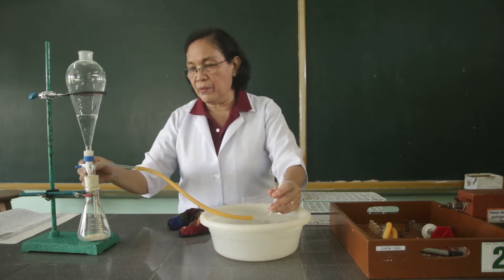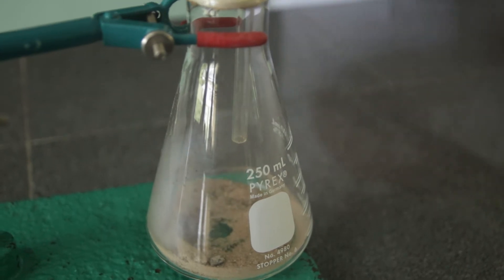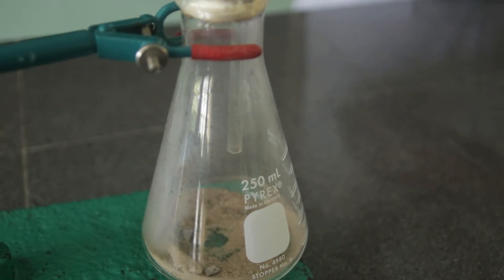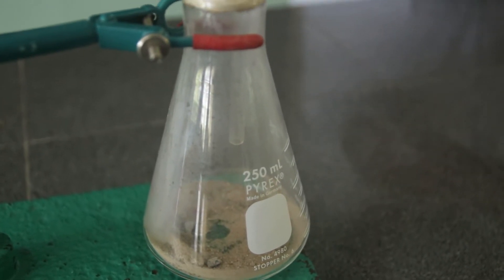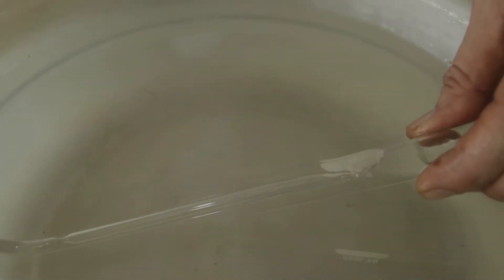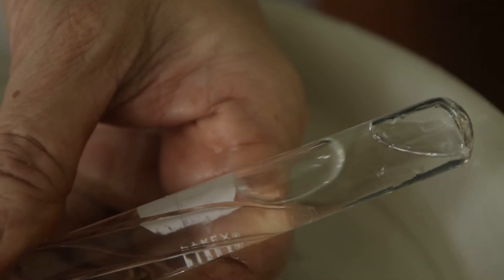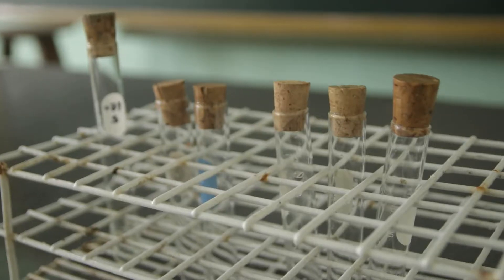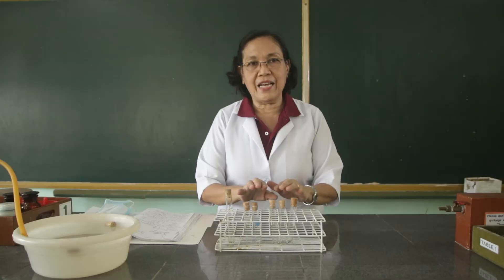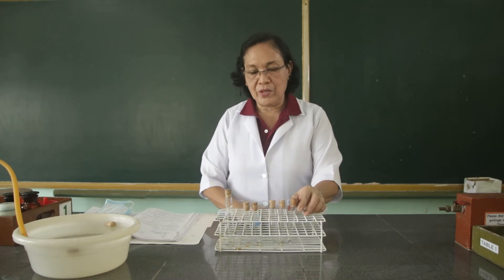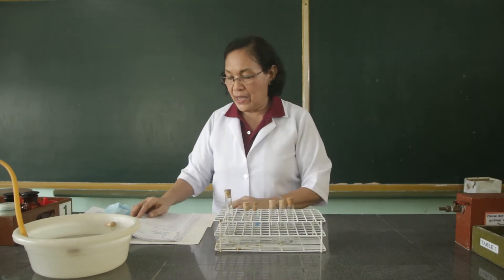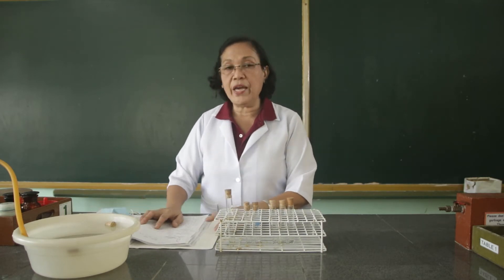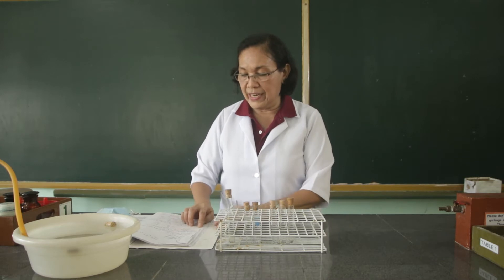We are now going to run down the water from the separatory funnel. I have already collected the five test tubes of the acetylene gas. You saw that I collected this by the water displacement method. We are going to submit this acetylene gas to the following tests. For the first test, we have the formation of copper acetylide.